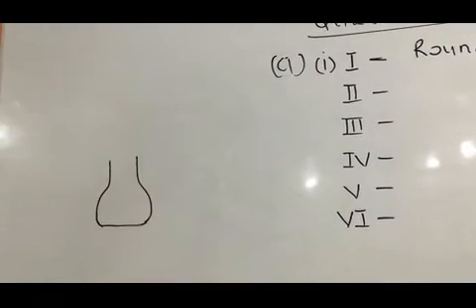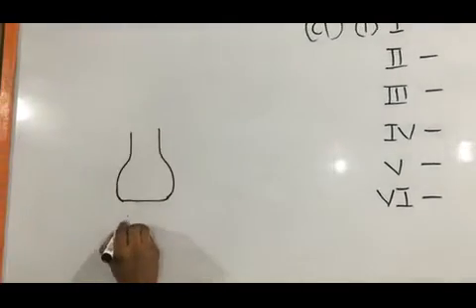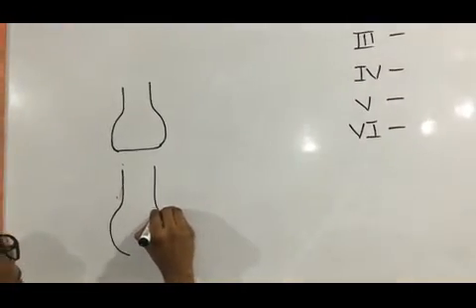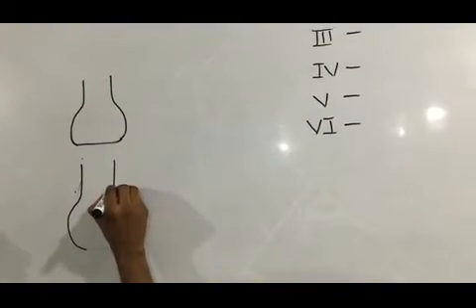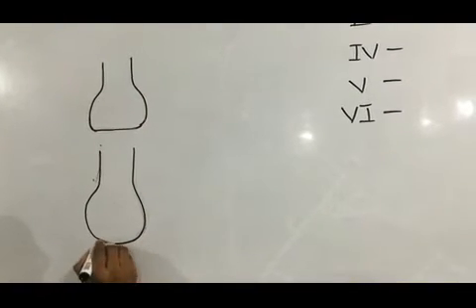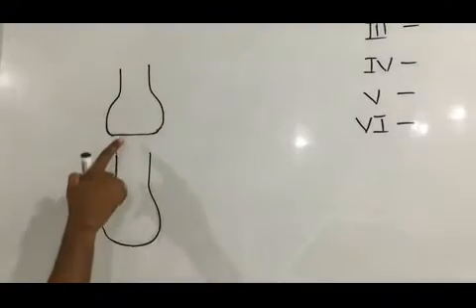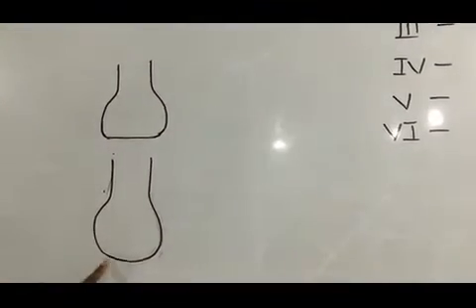But if you look at this diagram, the base is round.